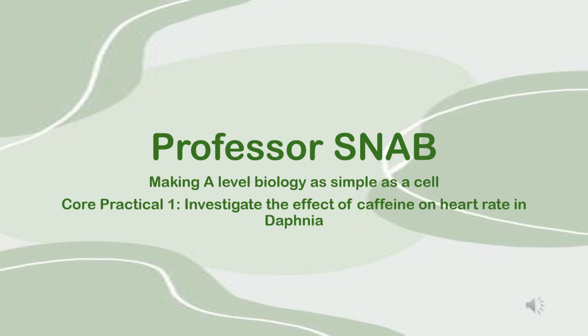So today we are looking at the first ever core practical in the entire A-level biology course, and it also happens to be the first ever core practical in topic 1. So let's begin. The core practical in question is to investigate the effect of caffeine on heart rate in Daphnia.